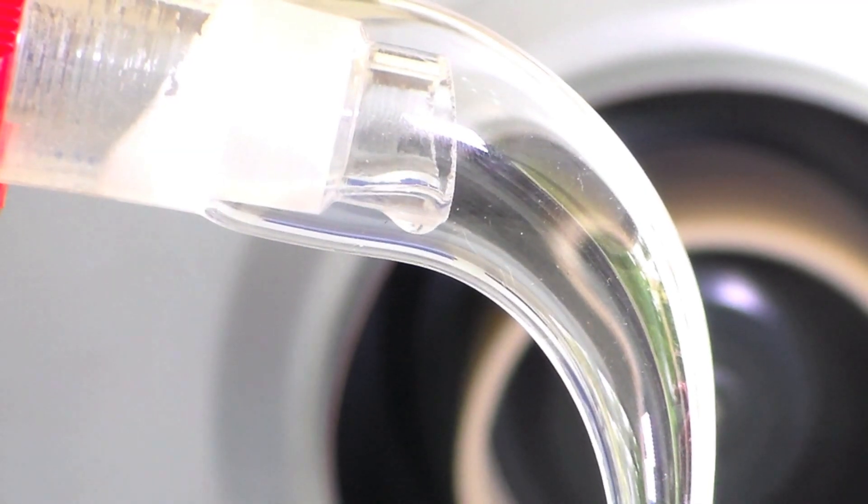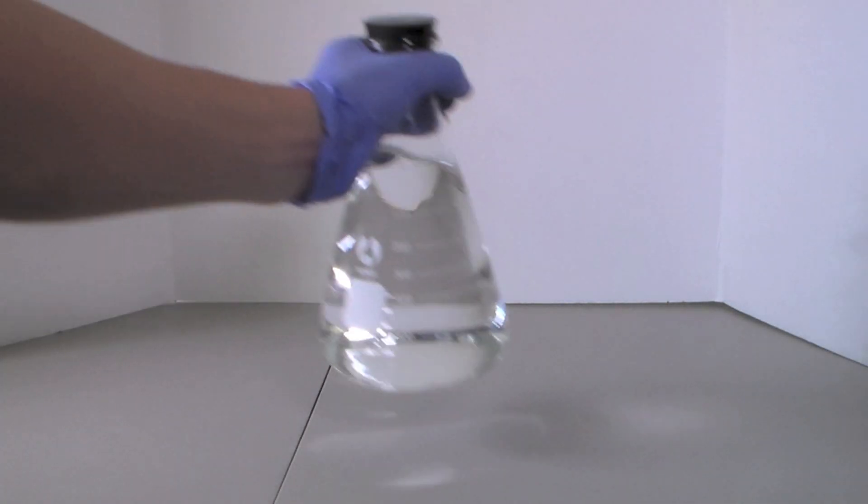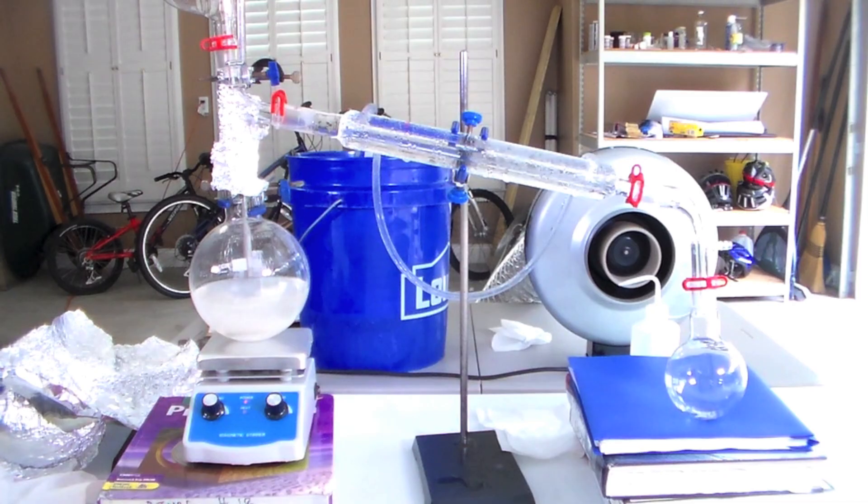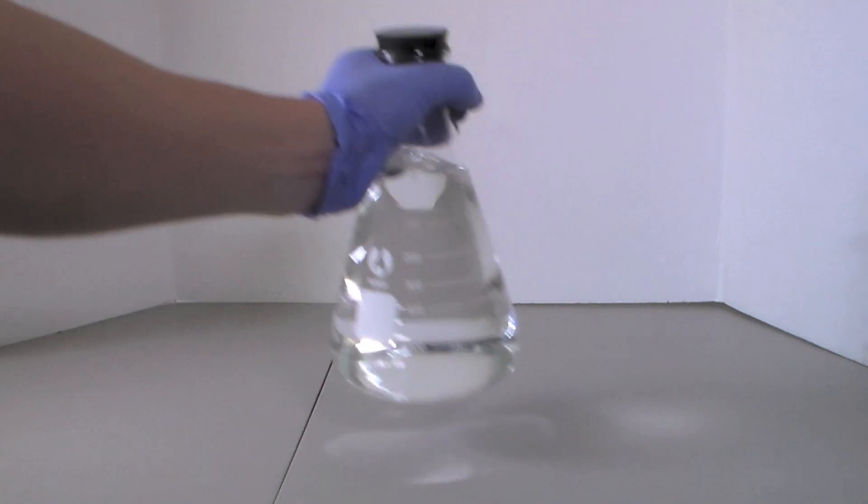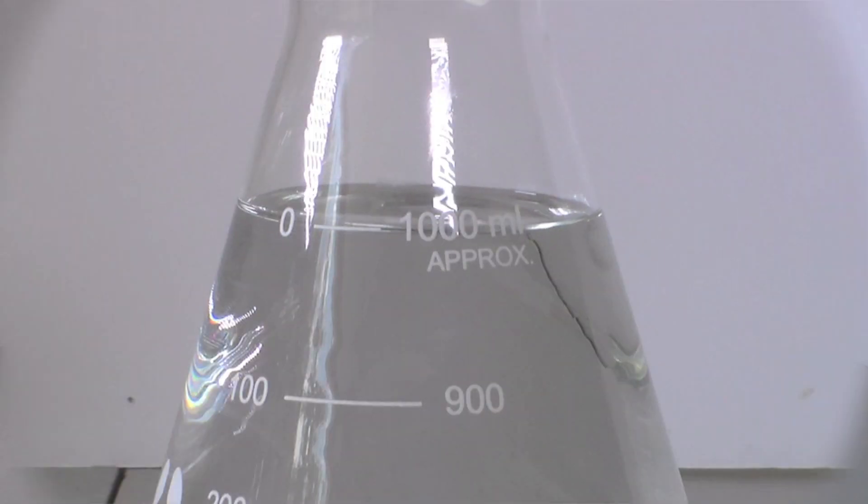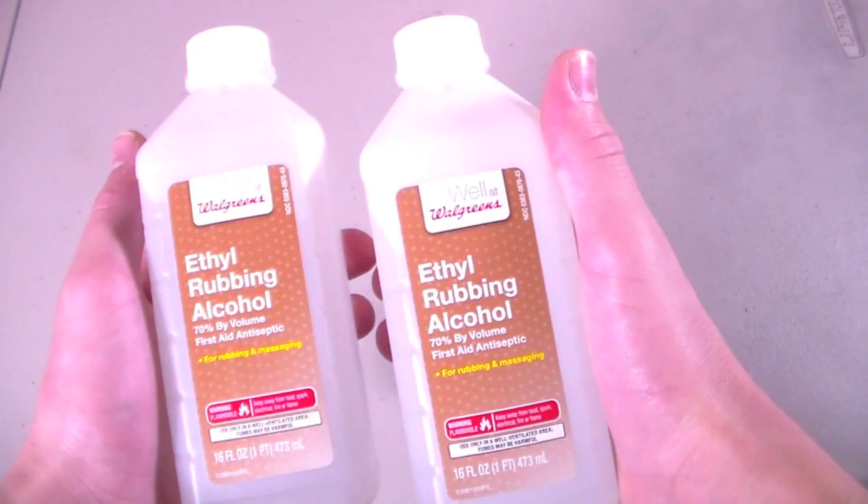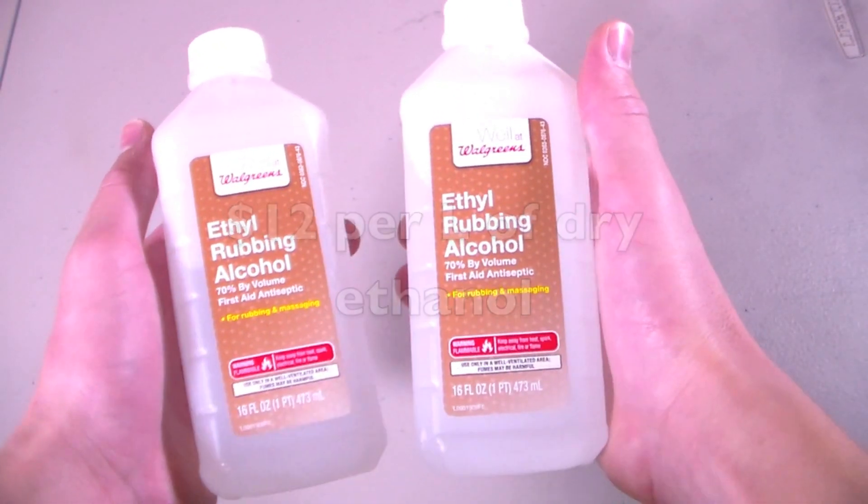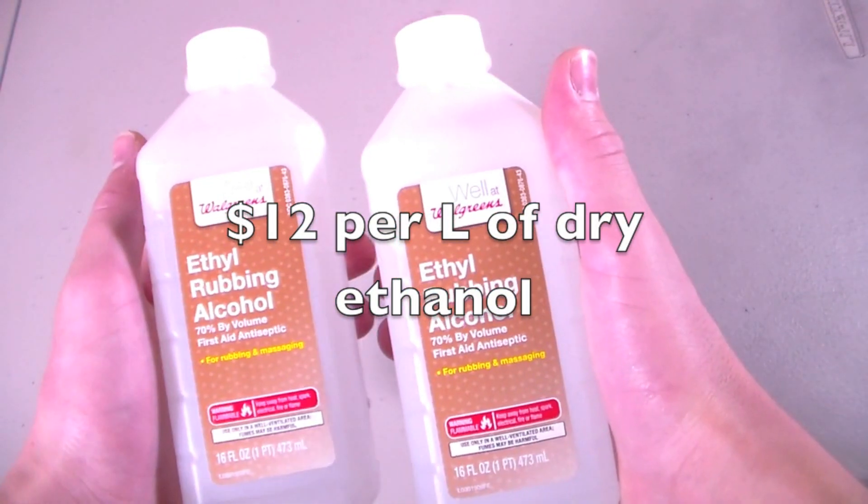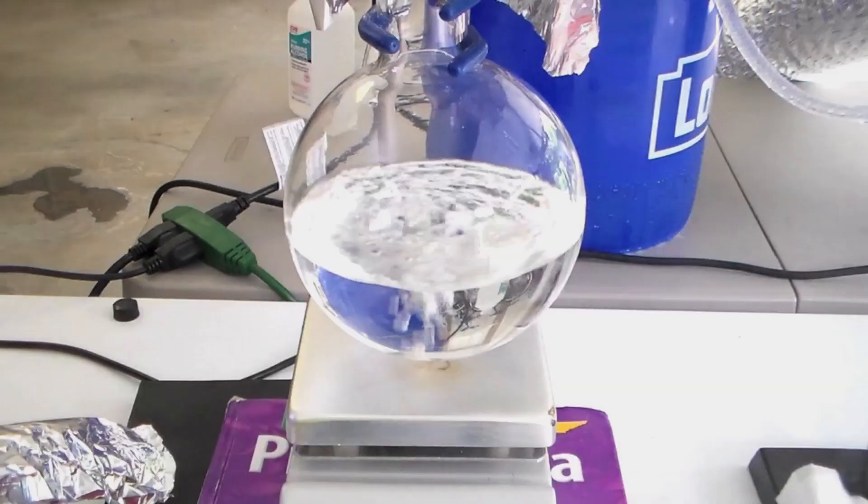This separation process is fairly straightforward and gives reasonably high yields, but it does take quite a bit of time, especially on a large scale. With this method I was able to obtain about a liter of nearly pure ethanol from four bottles of the 70% solution, which came to a total of about twelve dollars.